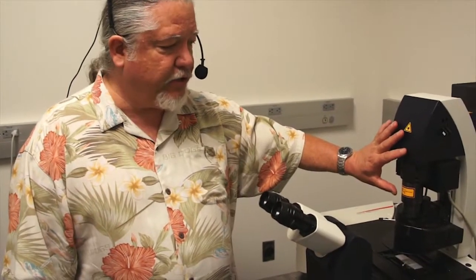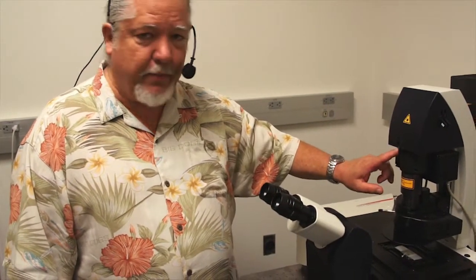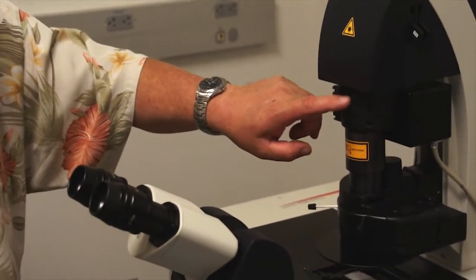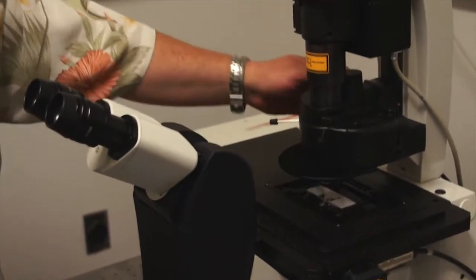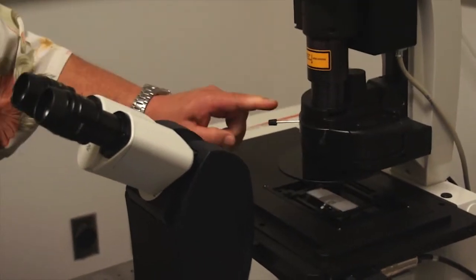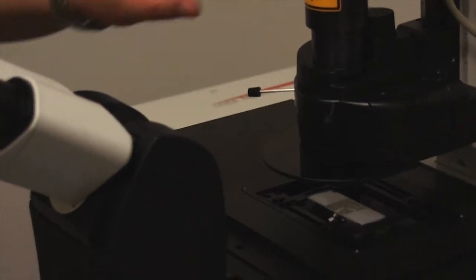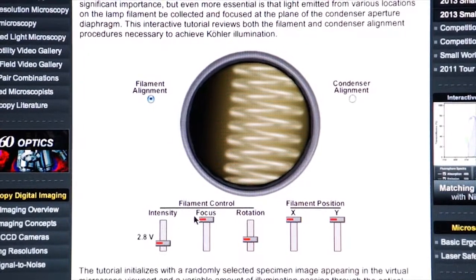To do this, we're going to use features of the illuminator. We're going to manipulate the field diaphragm. We're going to manipulate the height of the condenser by turning the knob up and down. And we're going to use these two alignment tools to align the condenser to the optical path.